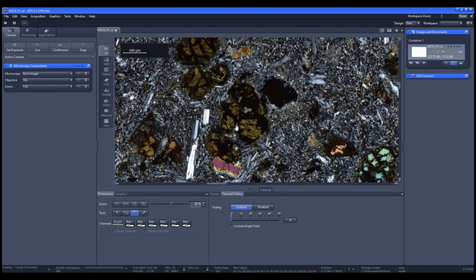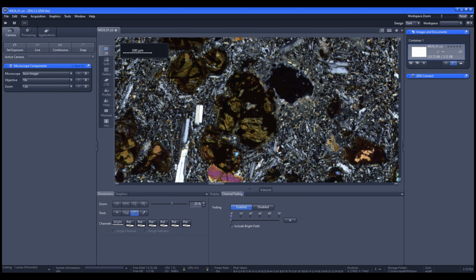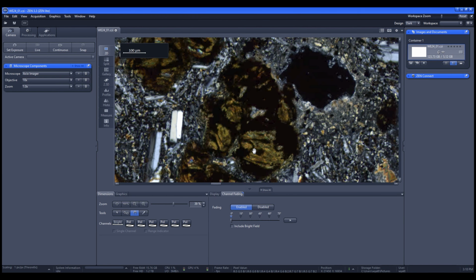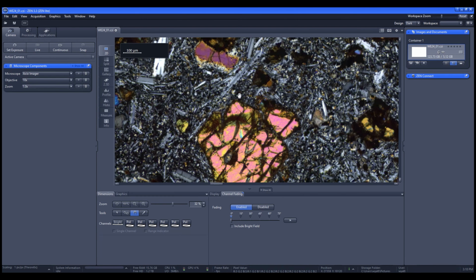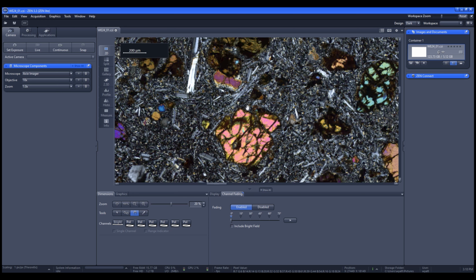Now, you'll notice these weird things here. They're kind of dark. They're kind of gross looking. These are also olivines. Why do they look different? Well, the key thing about olivine is it's stable in the mantle. When it is brought up to the Earth's crust, it becomes unstable. And when it becomes unstable, it starts to deteriorate into a clay mineral, or multiple clay minerals, and the catch-all term for this is iddingsite. So these olivines are being iddingsitized, or turning into iddingsite.